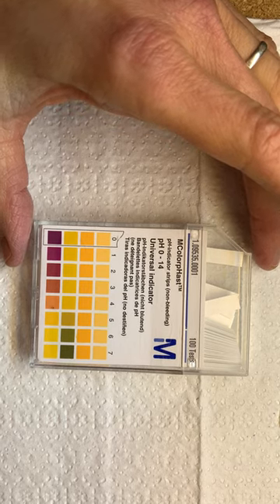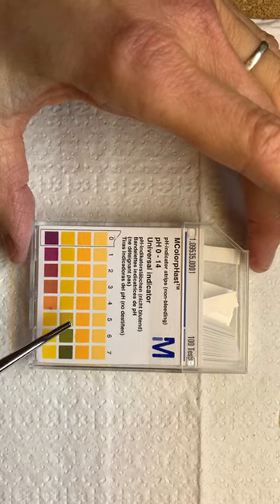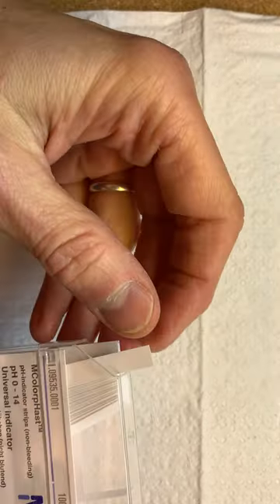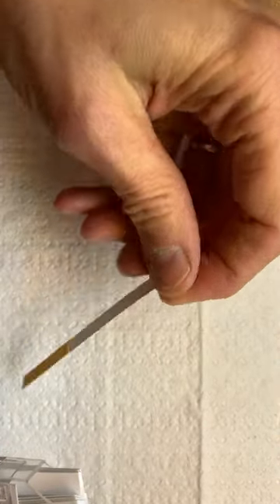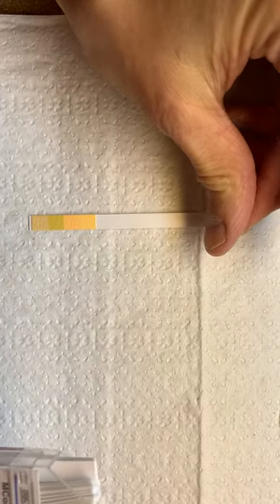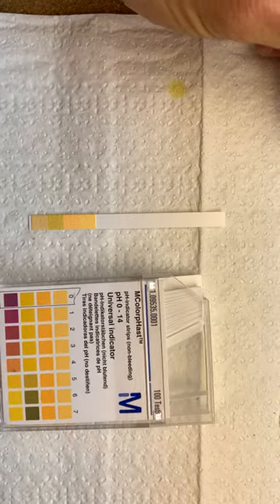Here we've got our pH indicator strips in this little container that has a key on it. The strips are clear on the back, and on the front you have a little tip that you will dip into a solution to figure out the pH.